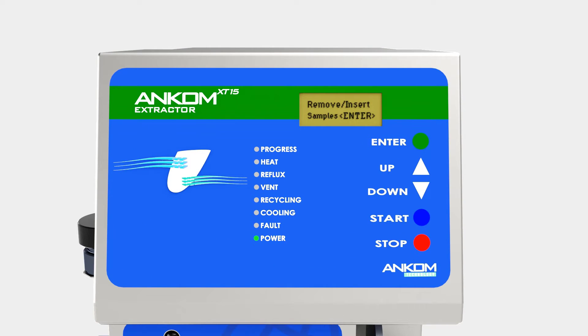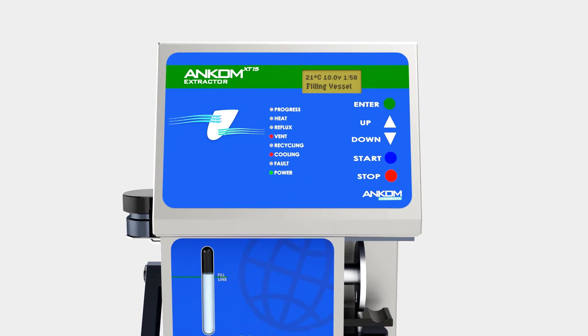After selecting the extraction time and closing the extraction vessel, the user pushes the start button and the system automatically controls the entire process.